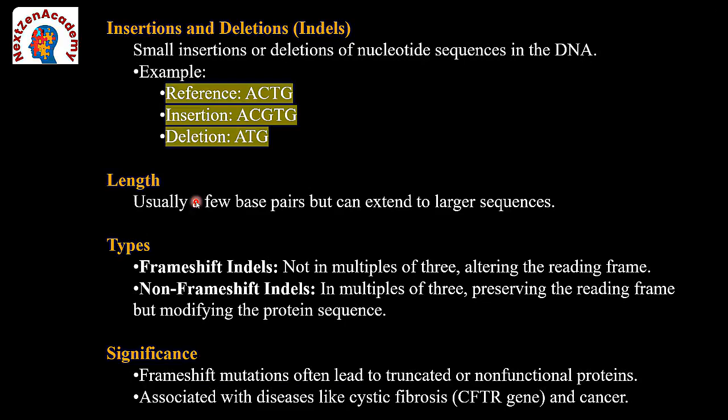That is called deletion, where one particular nucleotide is getting deleted. It usually affects a few bases, within 300, but sometimes a large number of base pairs can also get deleted.